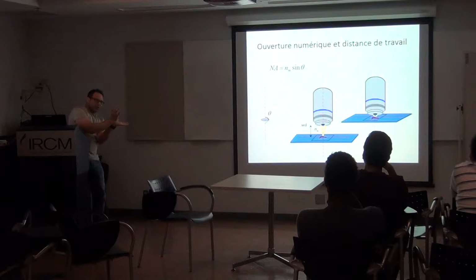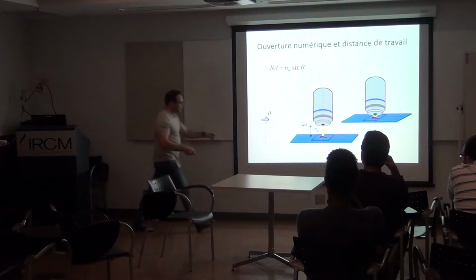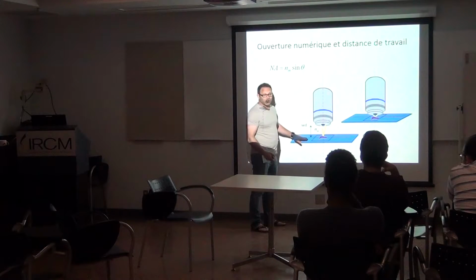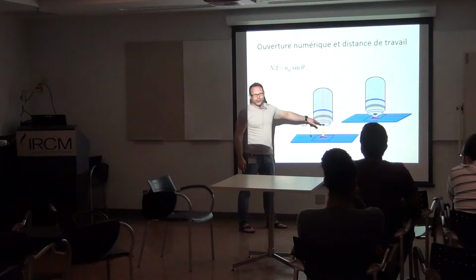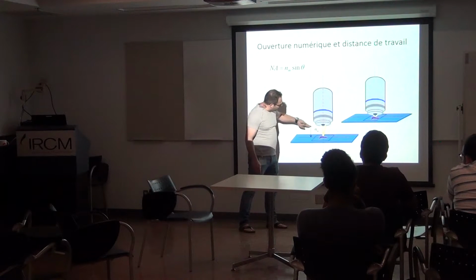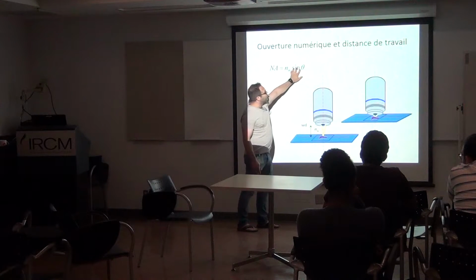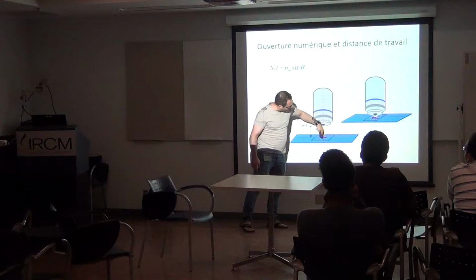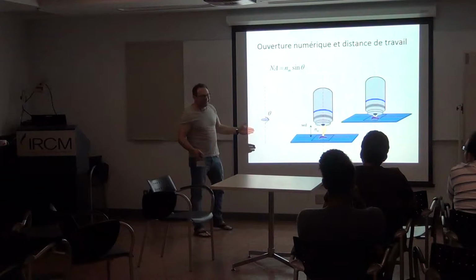If it's 90 degrees, it means the angle is really, really wide, and it cannot be 90 degrees. It would mean that you have an infinite surface. So the angle is usually really big, but at some point it gets smaller, and that is the sine of the angle, a number which varies. If it's 0, then it's 0. It means you don't have any length.